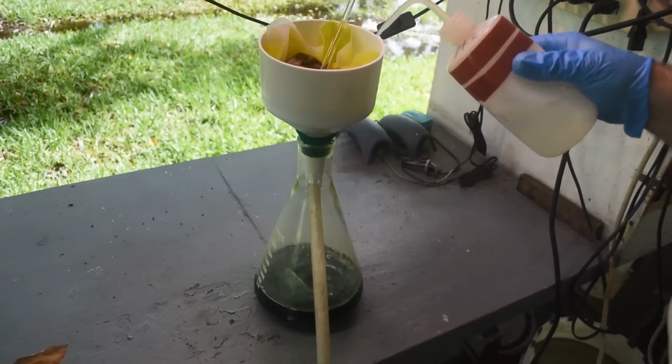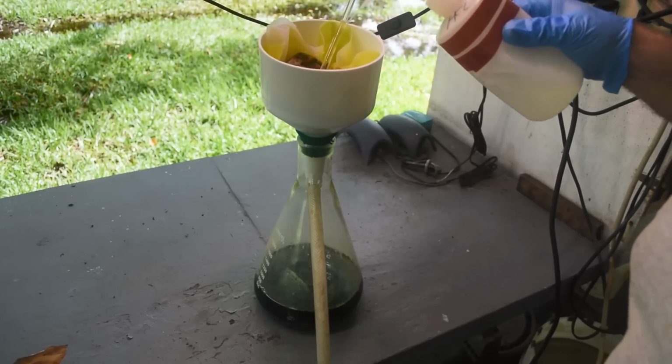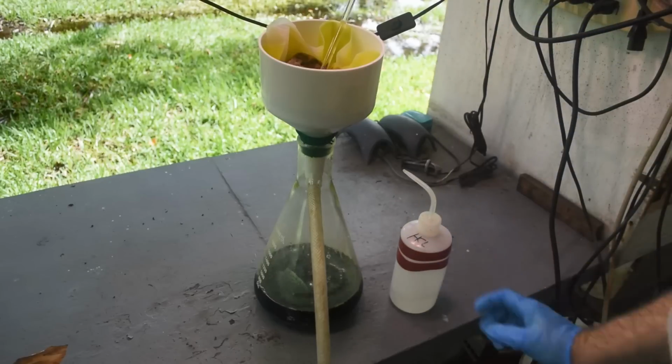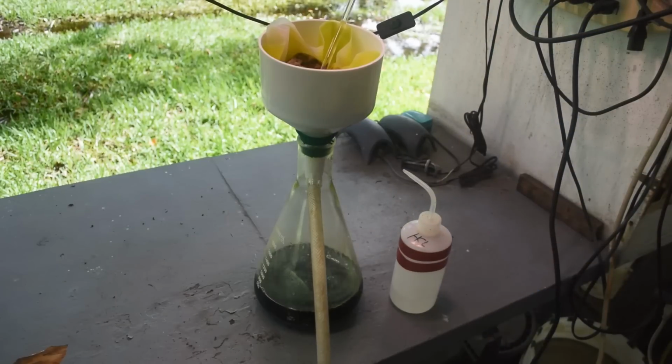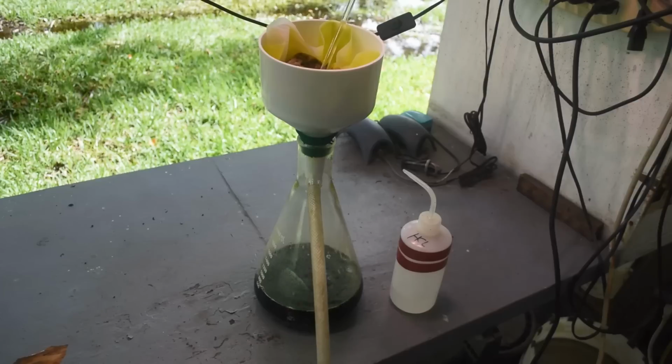Speaking of waste, we'll take a look at that in a second. I'm just going to try and clean this up as best I can by running a bunch of HCl through here, and then I'll just let this sit in the funnel and let the vacuum pull the liquid through and dry it out, and then we can move on to the next step in the process. But let's take a look at the waste and maybe do a stannous chloride test on it and see what's left in it, if anything.